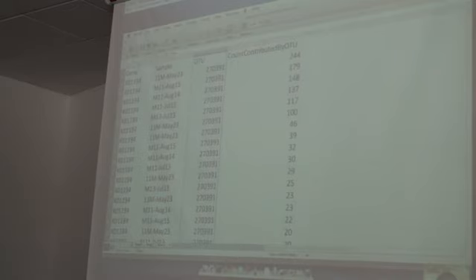So let's compare this with a different gene. This is one of the other high-ranking genes. And you can see that this is really swamped now by a single OTU, meaning that we see this large increase in this single OTU, which, by the way, is a member of the Rikenellaceae family that was significant before, so we're seeing a large contribution of the actual abundances for this particular one. And then lastly, this one's a bit more diverse, so we see more different OTUs contributing to the reason for it being statistically significant. Okay, so I think that's the end of my demo.